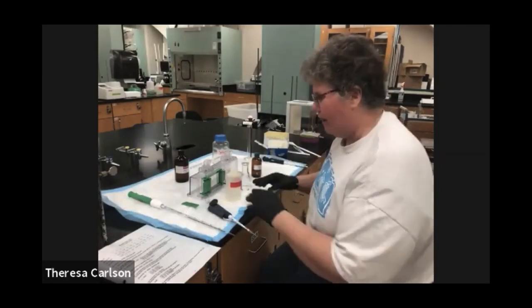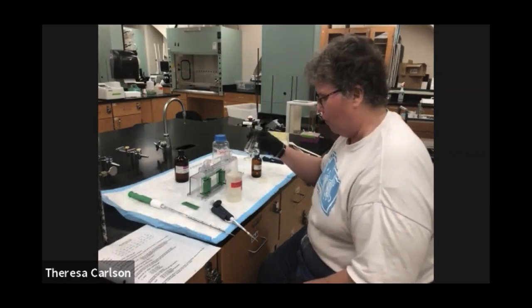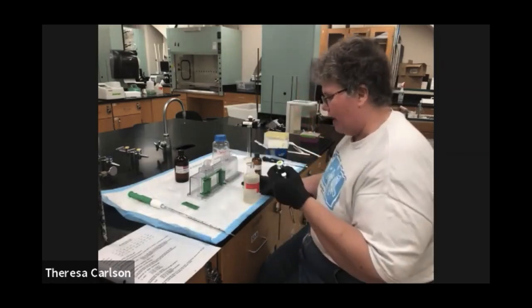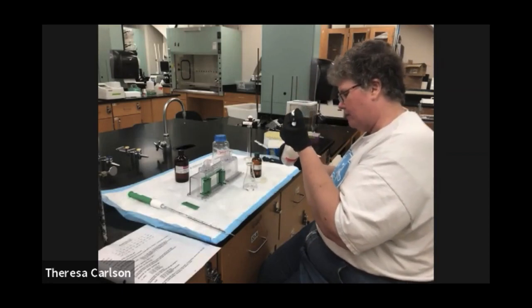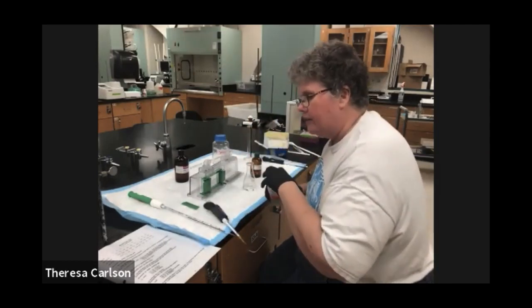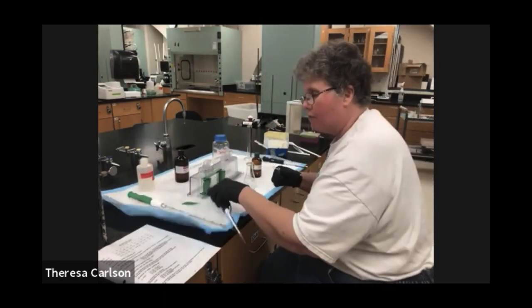Okay, so now we have everything set up here. We have our acrylamide solution with the solution A, the solution B, and the water in it. We have our plate all set up here. Now we're going to add 210 microliters of SDS, 10%. So you should have a solution of 10%, 210 microliters of that. And we're going to add 100 microliters of APS, ammonium persulfate, that will be already made for you.